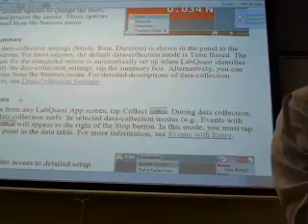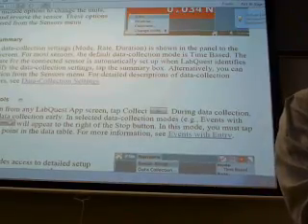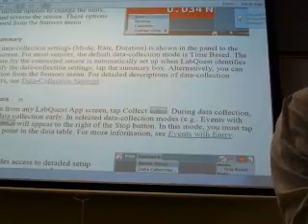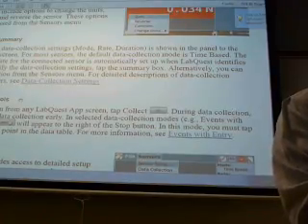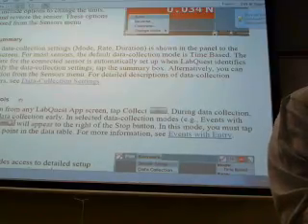0.01667. And so let's do a quick test. We're going to collect 120 minutes worth of data. Well, not 120 minutes, that'd take too long. Let's collect 120 seconds worth of data, or 2 minutes. That's under duration, right? Yeah, duration.